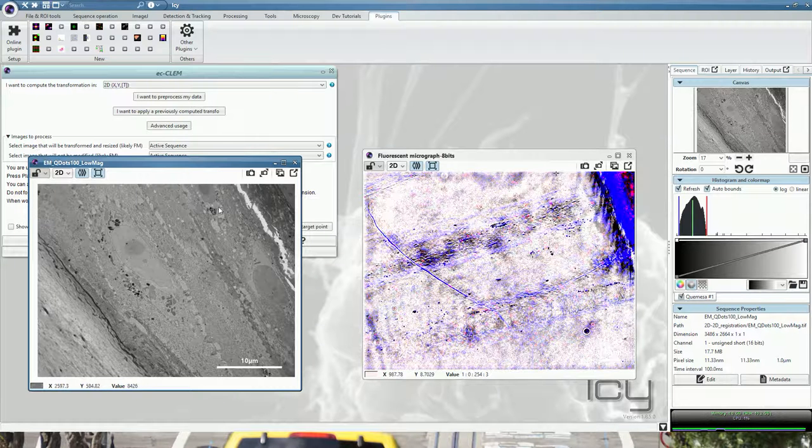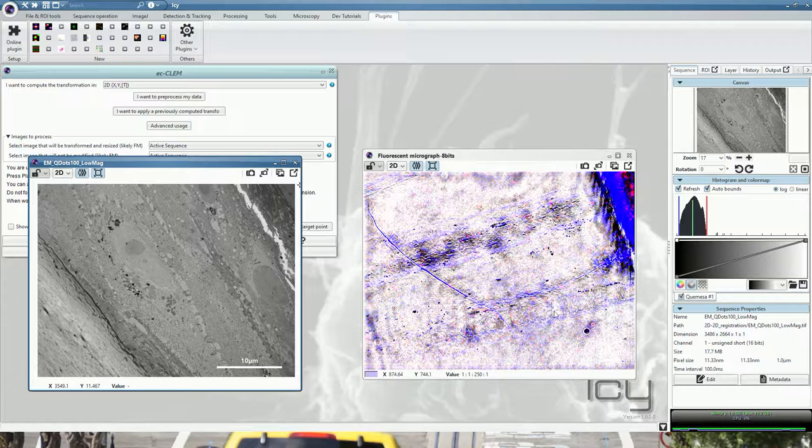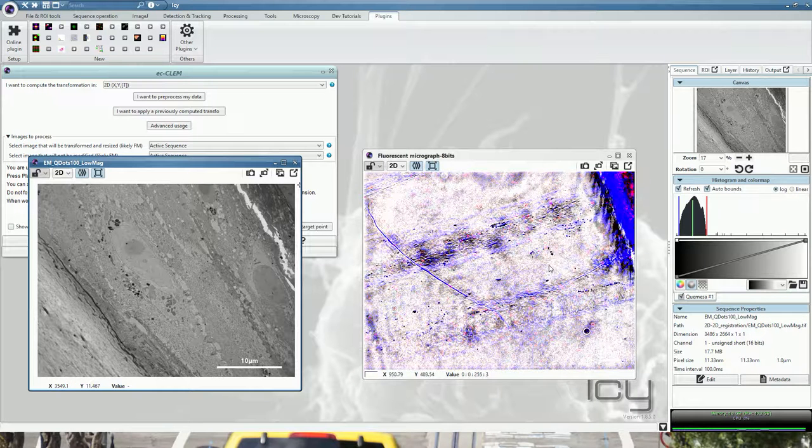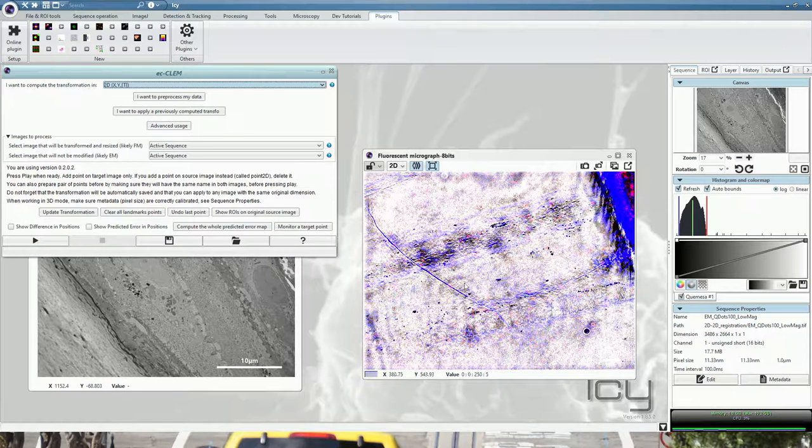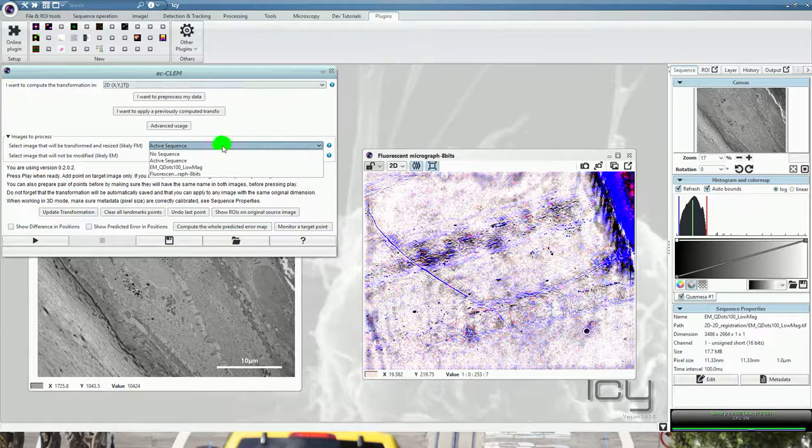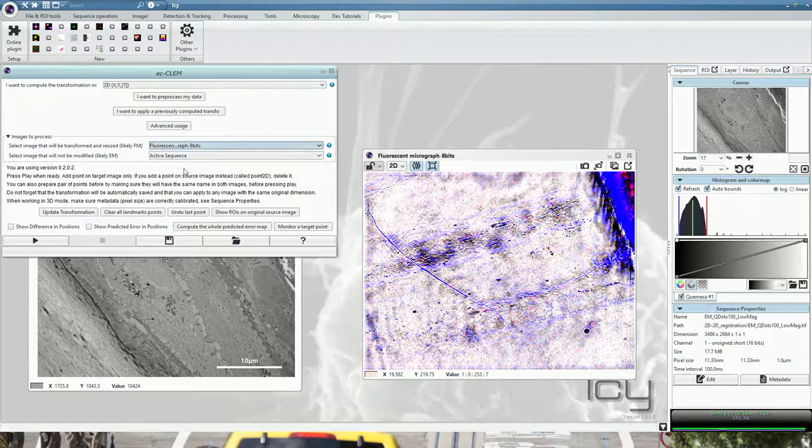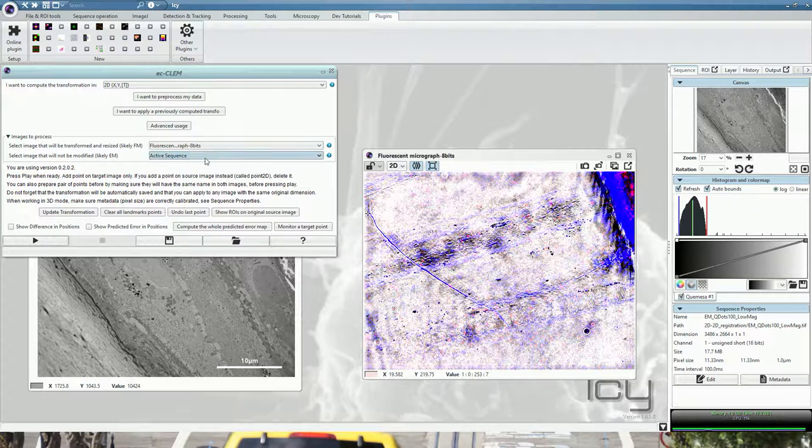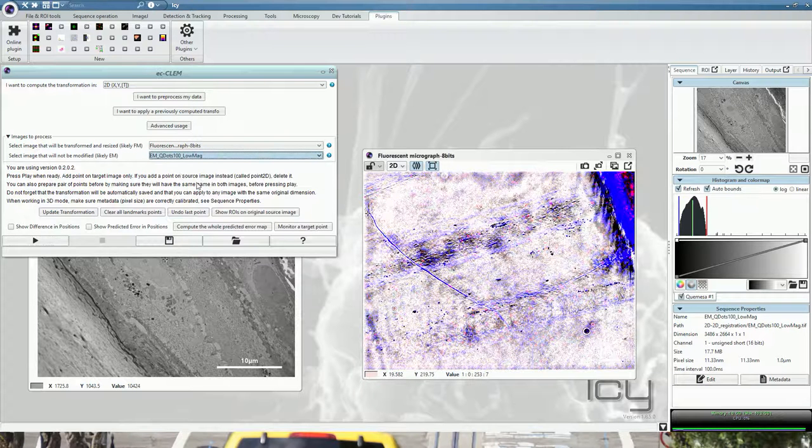Do you want to locate your electron micrograph into your light microscopy, or do you want to locate a fluorescence signal into your electron micrograph? In our case, we will locate a fluorescence signal into the electron micrograph. So the source will be the fluorescence micrograph and the target will be the electron micrograph.